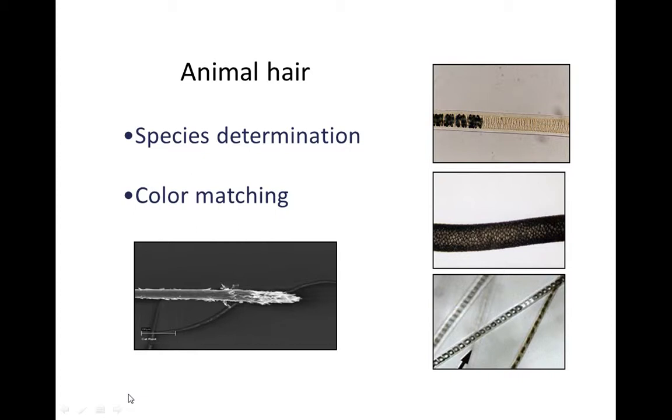The photos on this slide show a cat hair where you can see the paintbrush root. On the right-hand side of the slide, the top photo is of a fox hair, which has a vacuolated medulla that also displays the clear or light sections and also the dark sections that can be seen with medullas. The middle photo is one of deer hair, and you're primarily seeing the medulla of the hair, which is a lattice pattern. The bottom hair is a rabbit hair with a uniserial medulla.